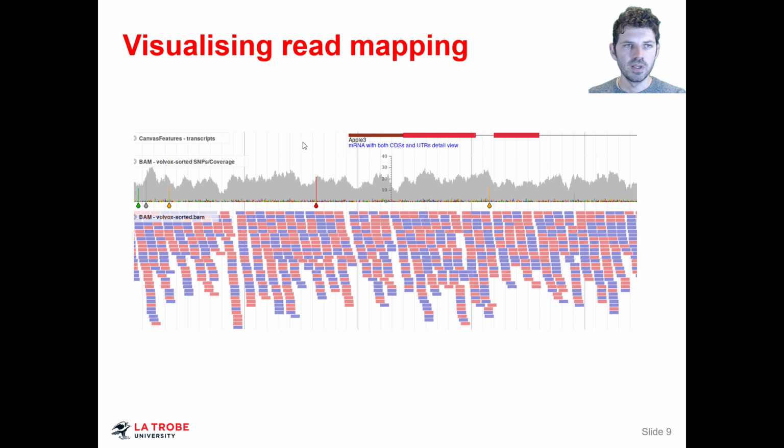So this is showing you that we have a protein coding gene here. These are likely to be some introns and exons. You can see there's blocks and lines connecting them. That usually means that there are protein coding regions, and then they're interspersed with non-protein coding regions of a gene. And then we have these 2 parts down here.